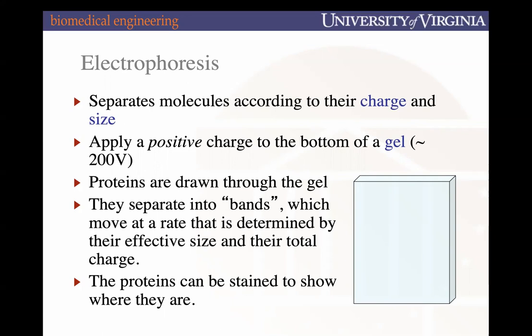So it's using electricity to promote movement. Phoresis, I don't have a background in Latin, so I'm sure some of you might have the exact definition, but we usually think of it as the movement of proteins across an electric field. And so we use this technique of electrophoresis to typically separate proteins based on their charge and by their size.